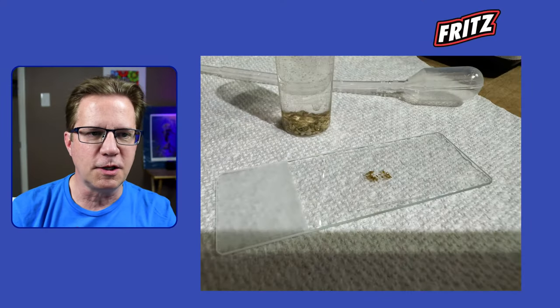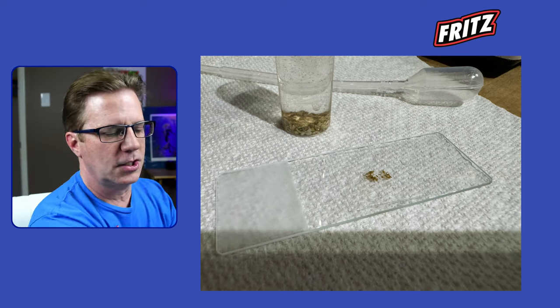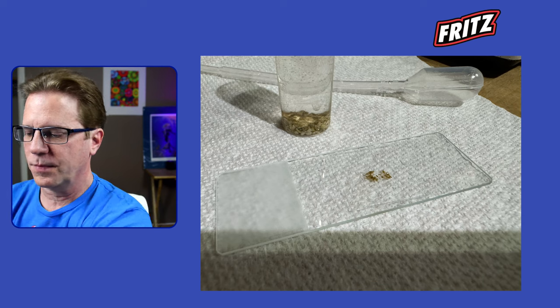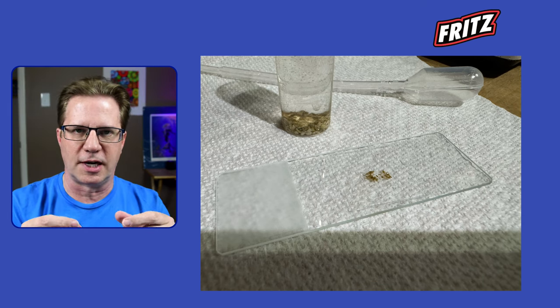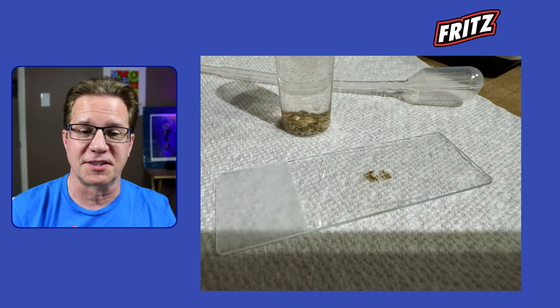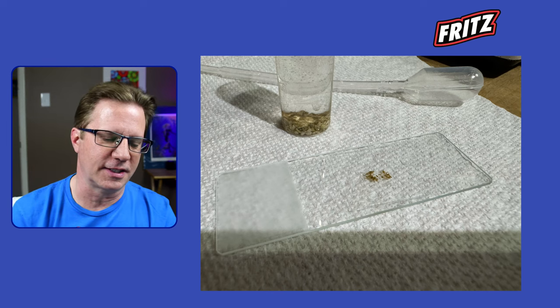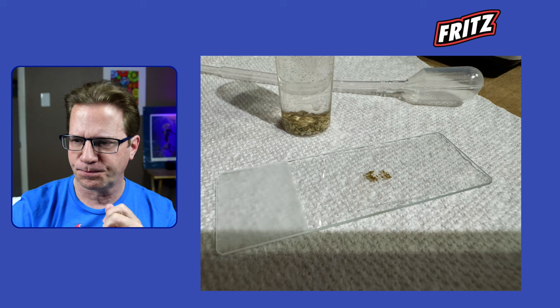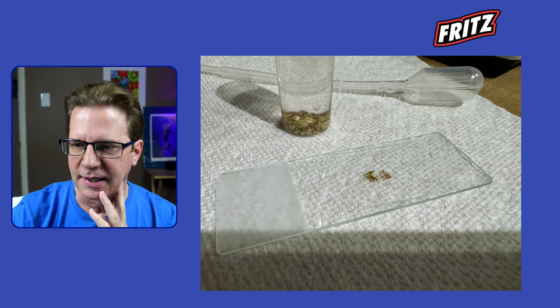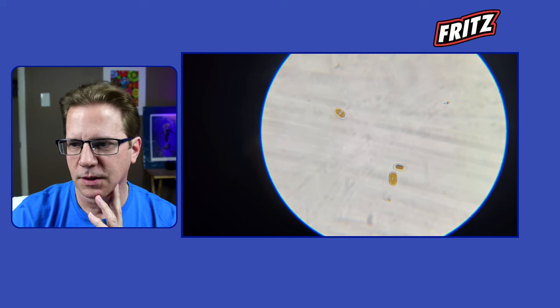That allowed me to look more closely at the area on the slide, because otherwise a drop of water looks like nothing — just clear glass. On my second attempt I put a little bit of detritus in there and then took videos.